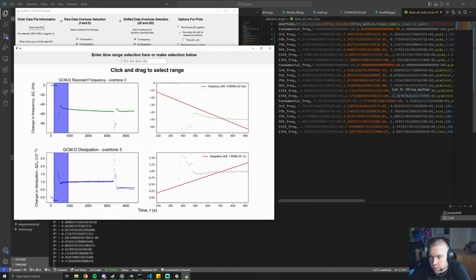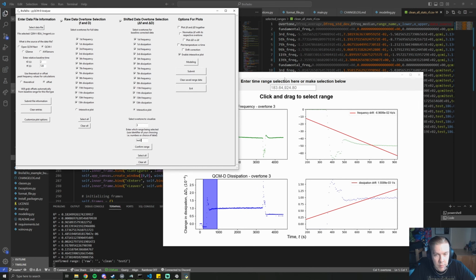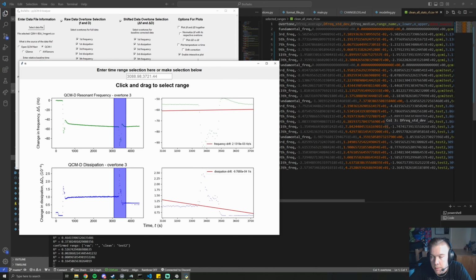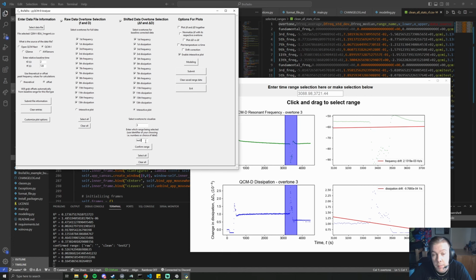And you can see here that these other two ranges did not change at all. And if I do test 2, range, make another selection, then we have a new set of rows for our selection. If I do it again, test 2 will update, but test, QCM-I test, and QCM-I stay the same, because again, these do not get removed. They only get updated when you make a selection updating the same range.